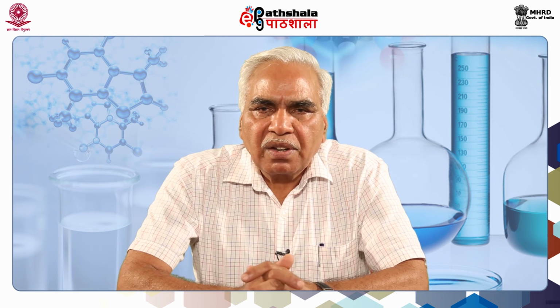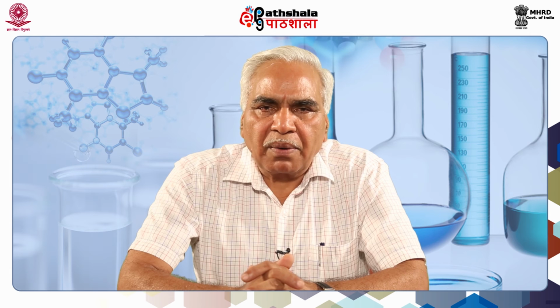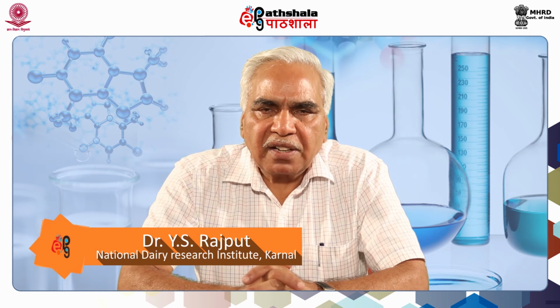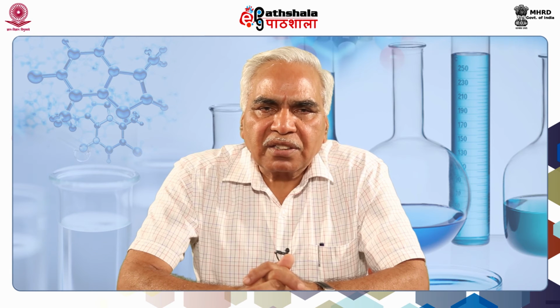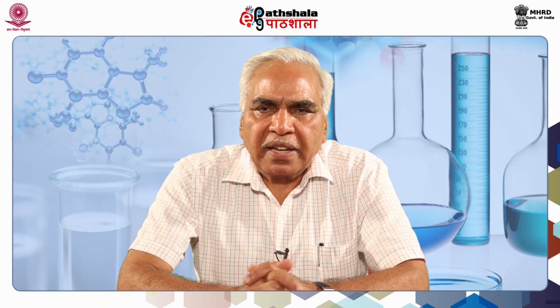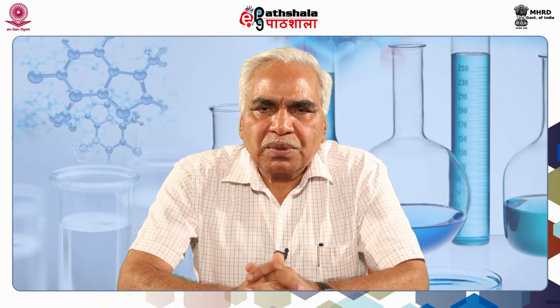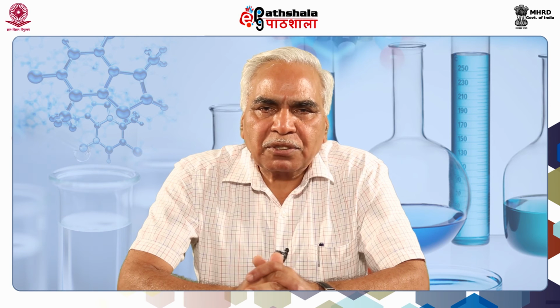Dear students, so far we have covered the principle of blotting techniques in general and Southern blotting in particular. Southern blotting gave birth to other blotting techniques. In contrast to Western blotting, Southern blotting can be performed without electrophoretic transfer.